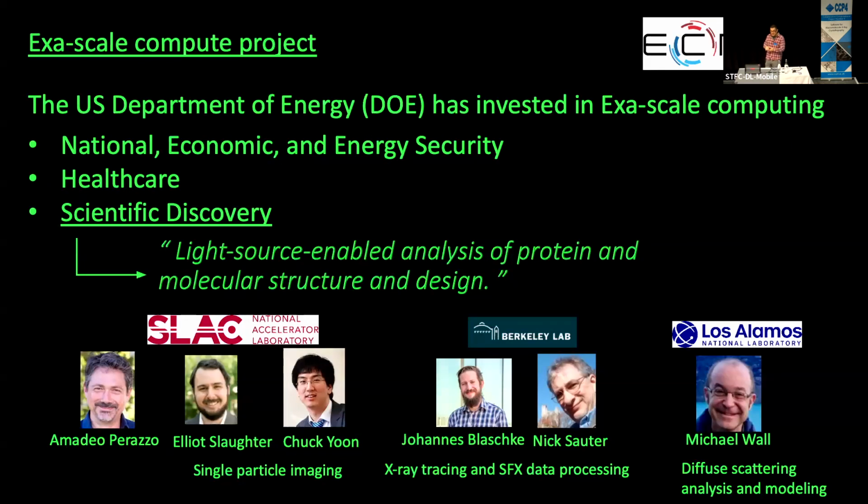So there's these big computers, and a big driver for the development of these computers are actually light sources. And so there's this Exascale Computing Project that's funded by the Department of Energy in the United States. And they have several goals, but one of them is light source enabled analysis of protein molecular structure and design. And there's several teams working on this, and these are just a few. And I was working with Nick Sauter and Michael Wall and Johannes at Berkeley. And so I'm going to be talking today about some of that work.